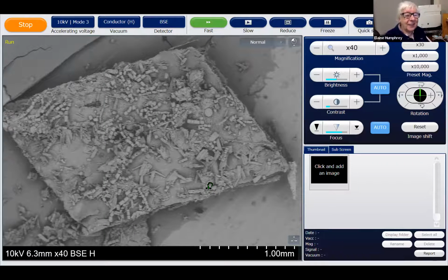And so unfortunately, I'm just the electron microscopist. And when we have a session and the experts come in, like you guys, I'm just using the microscope and they're coming in and saying, well, we need to just lift that up a bit. We need to tilt it a bit so we can see underneath. And then we find out that we can't actually see underneath. So we have to go find another one. But, one thing leads to another.